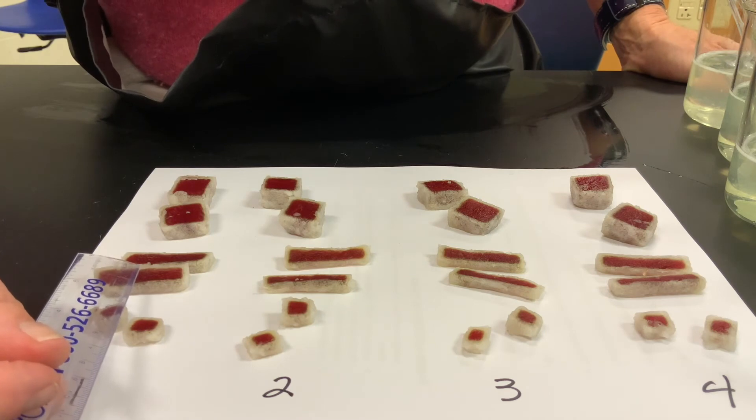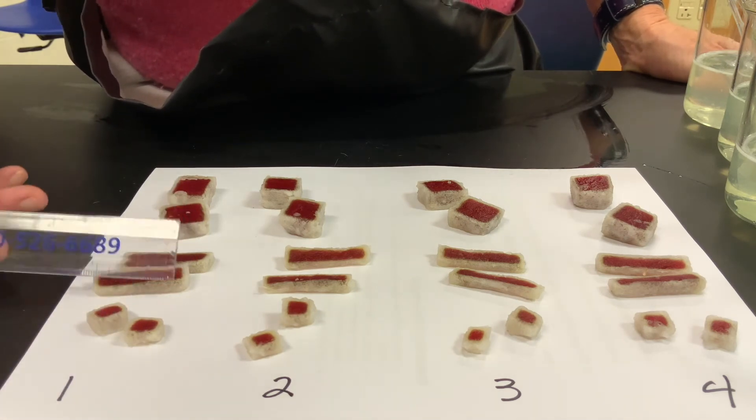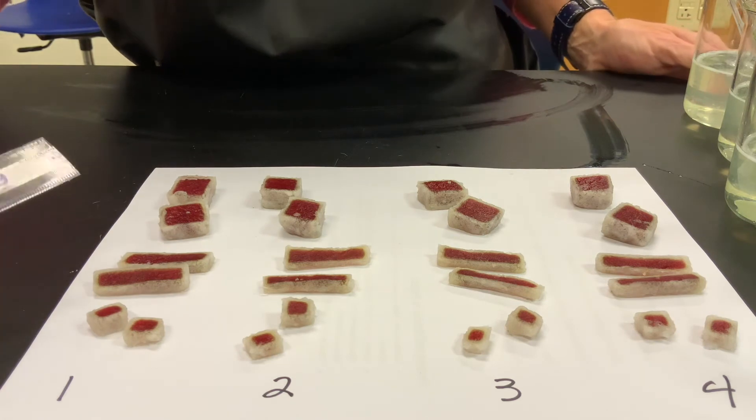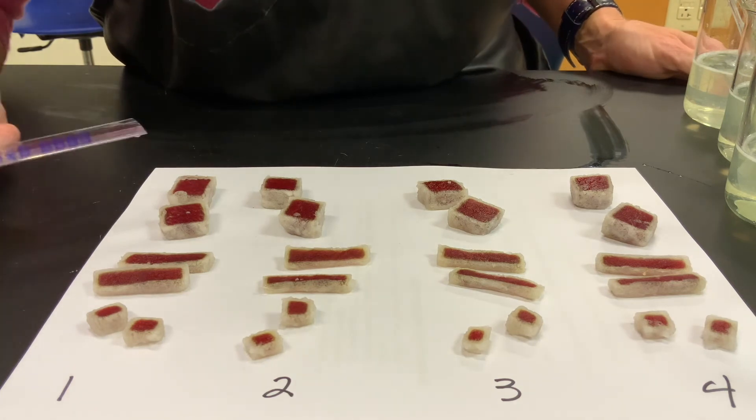Looking at the 1 by 1 by 4 prism, it is also 2 millimeters of diffusion on both sides, and you can see there is a lot more area that is not being reached by the bleach from the outside.